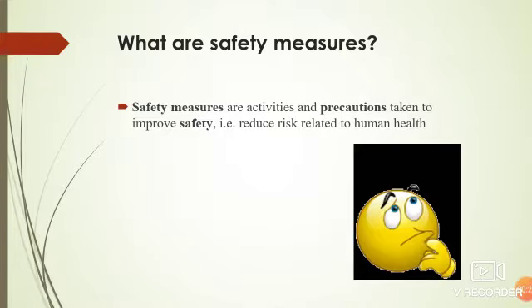So first of all, what are safety measures? Safety measures are the activities and precautions taken to improve safety, i.e., reduce risk related to human health. It is a term used to describe any precaution taken to increase the safe performance of a work, safety and protection from danger. It is a preventionary action — a precaution taken to increase safe performance when we work in the lab. The precautions we take while working in the lab are the safety measures.